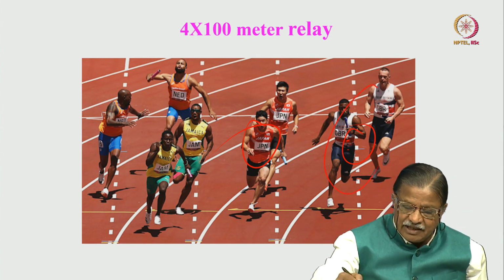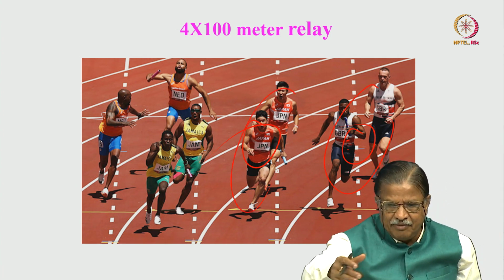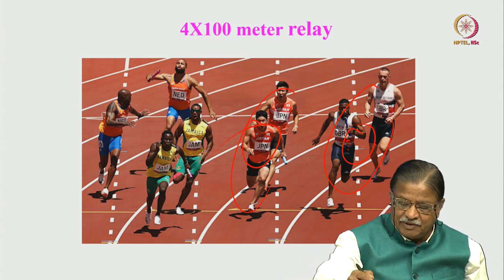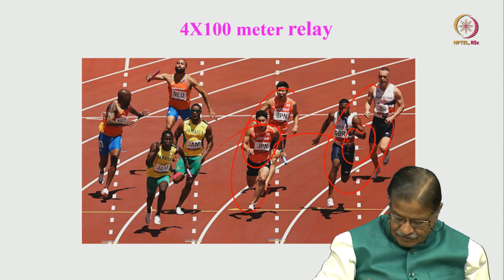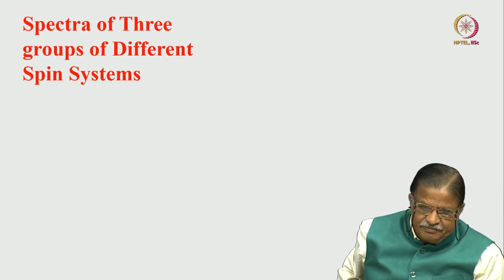If you consider the spin systems, there is a transfer of baton among teammates, like among all the spins of the same coupled spin system, but there is no transfer between the systems. This is how TOCSY works.